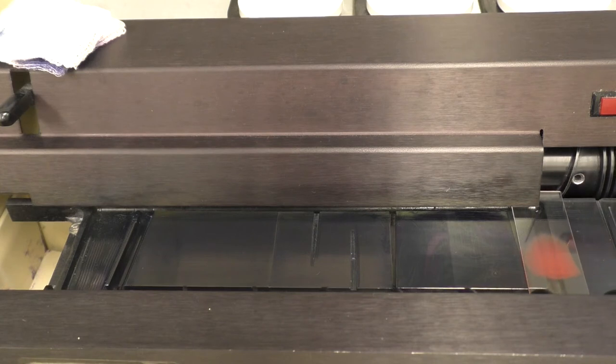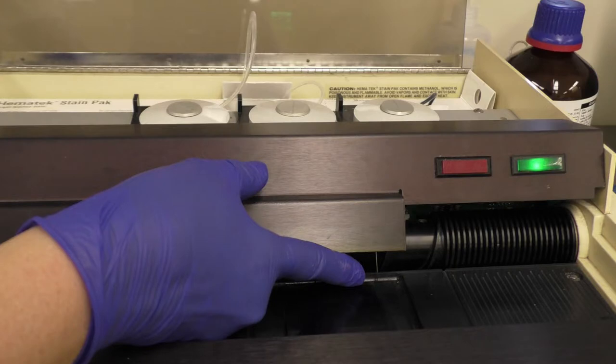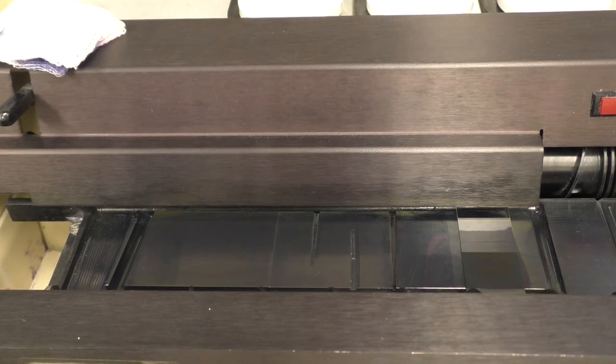The leading edge of the slide moves into contact with the stain-sensing switch finger that activates the stain pump. The stain is then delivered through a cannula and tube network to the platen orifice. The capillary space between the undersurface of the slide and the platen is filled with stain.